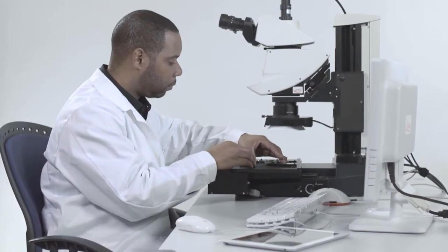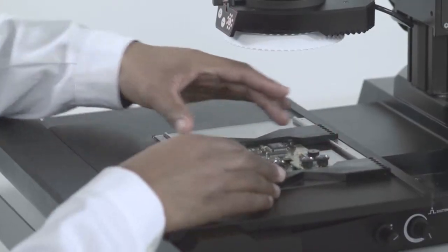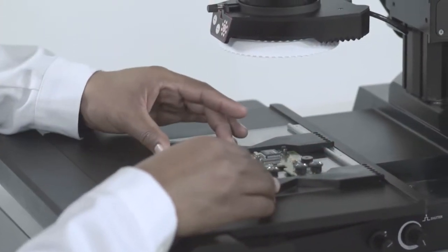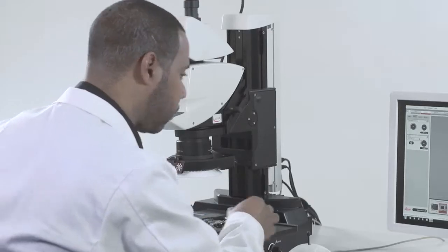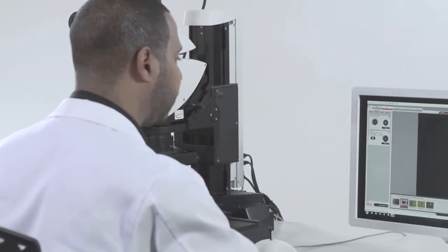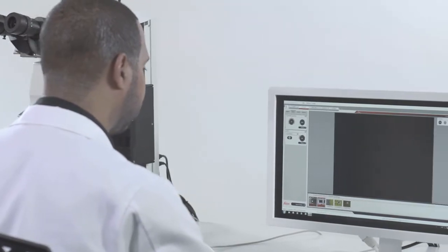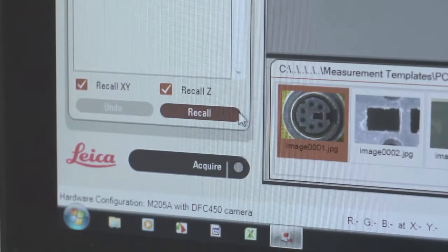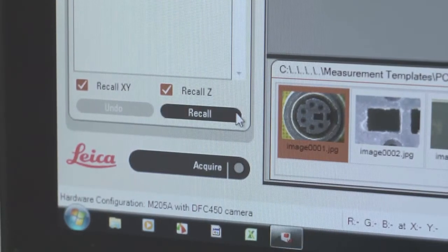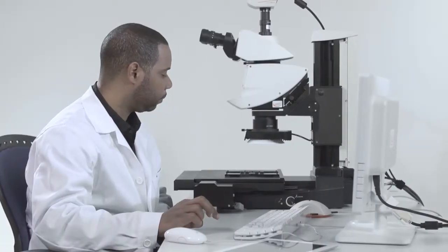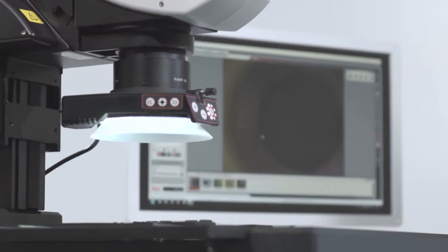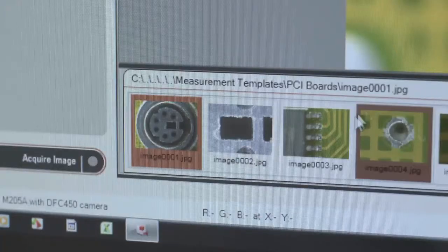Do you have advanced and recurrent samples? Are you under time pressure? The Leica microscope assistant is the solution.